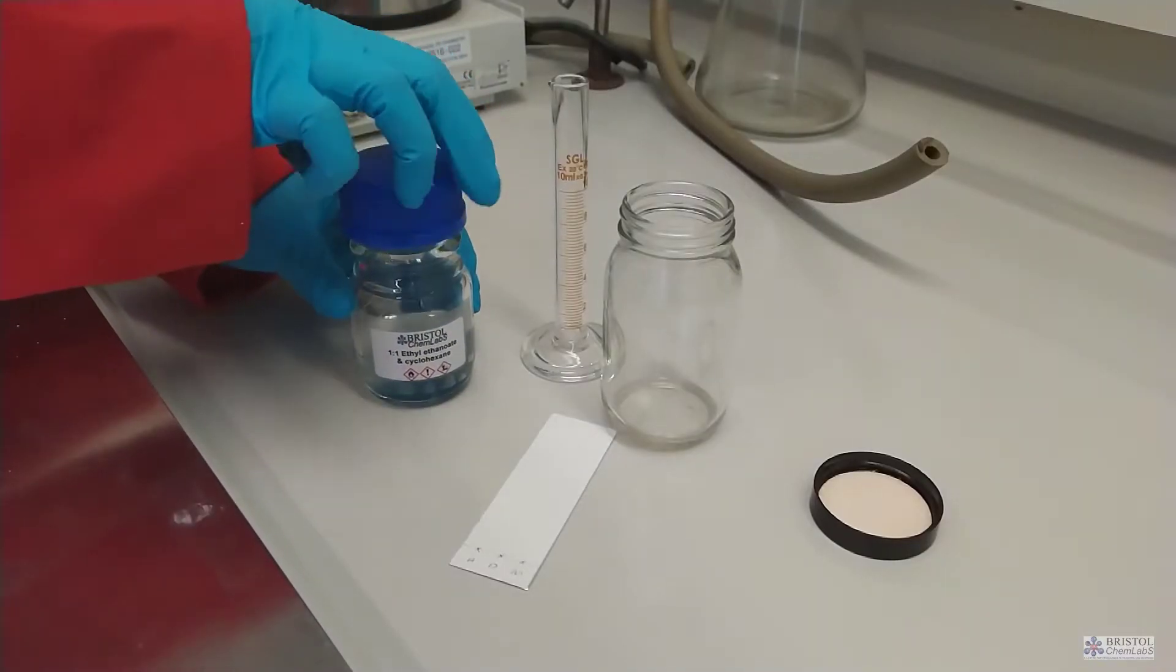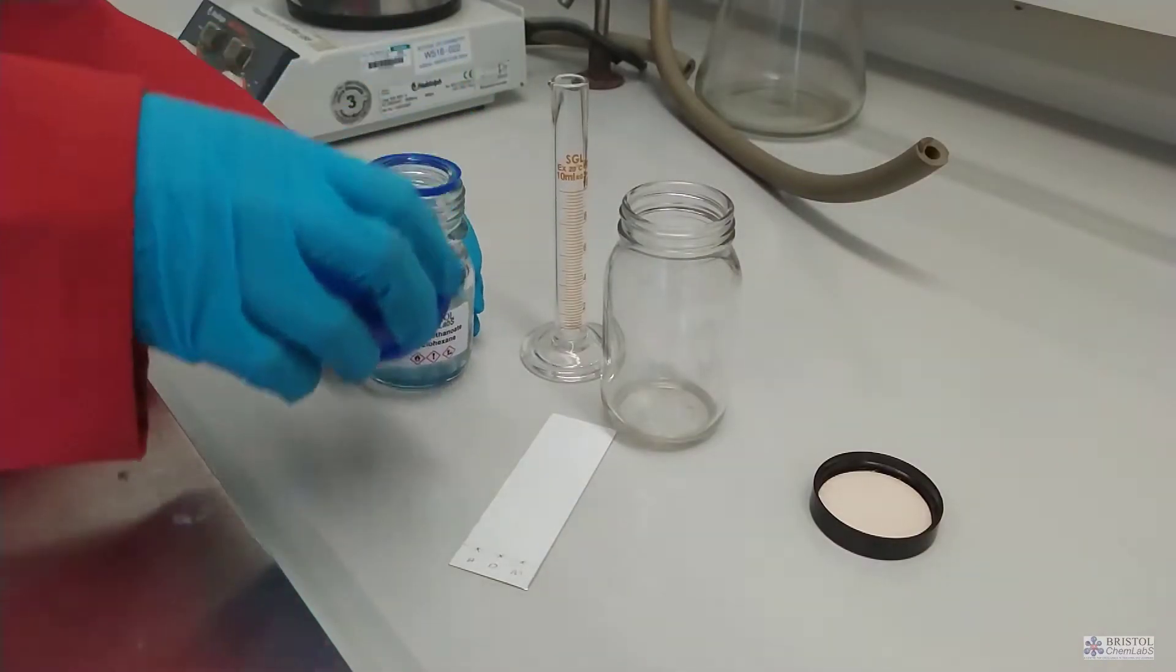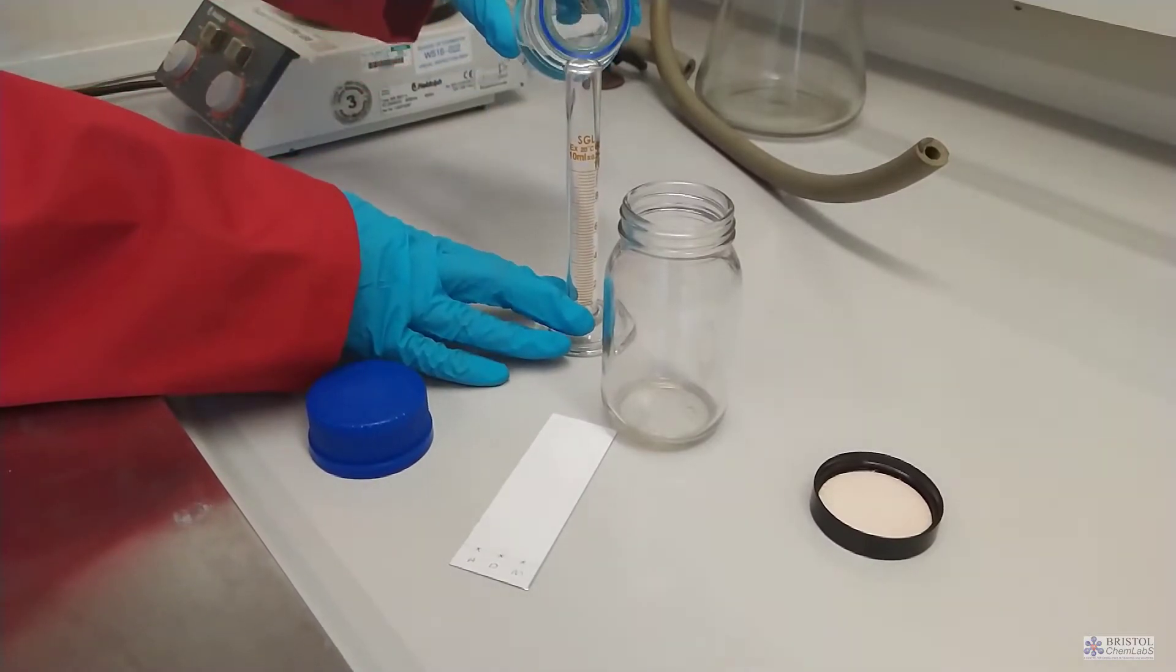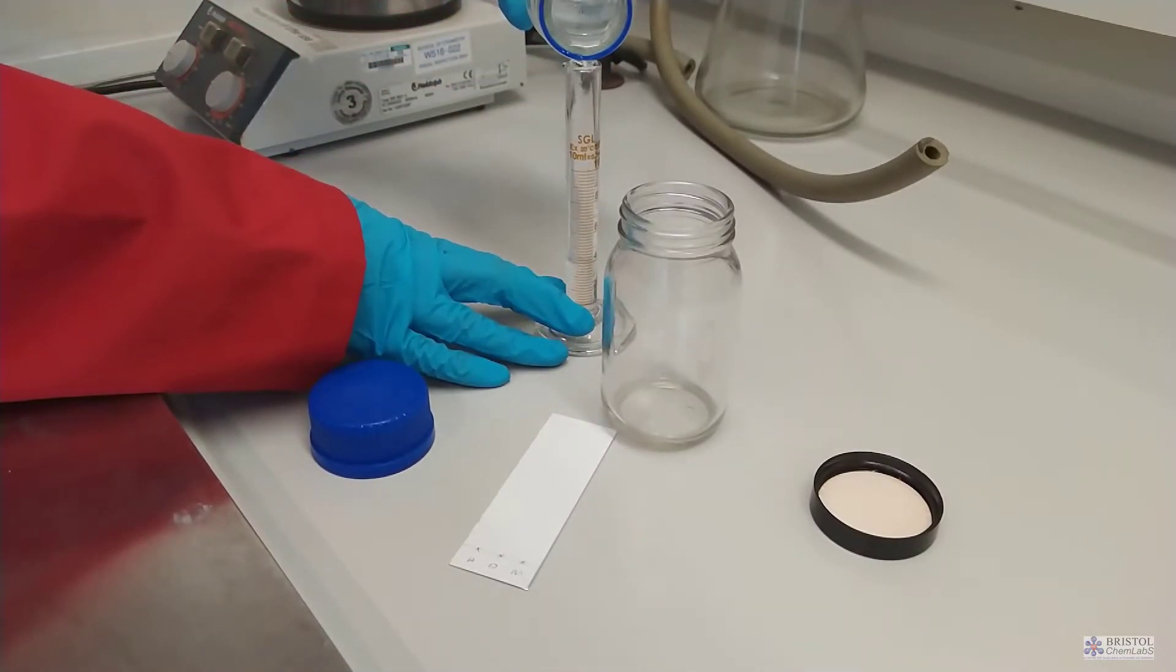The plate then needs to be put in a sealable jar with some appropriate solvent. The solvent mixture is ethyl ethanoate with cyclohexane in it. Ensure that the solvent level starts below the pencil line. Otherwise the mixture will simply dissolve into the solvent.